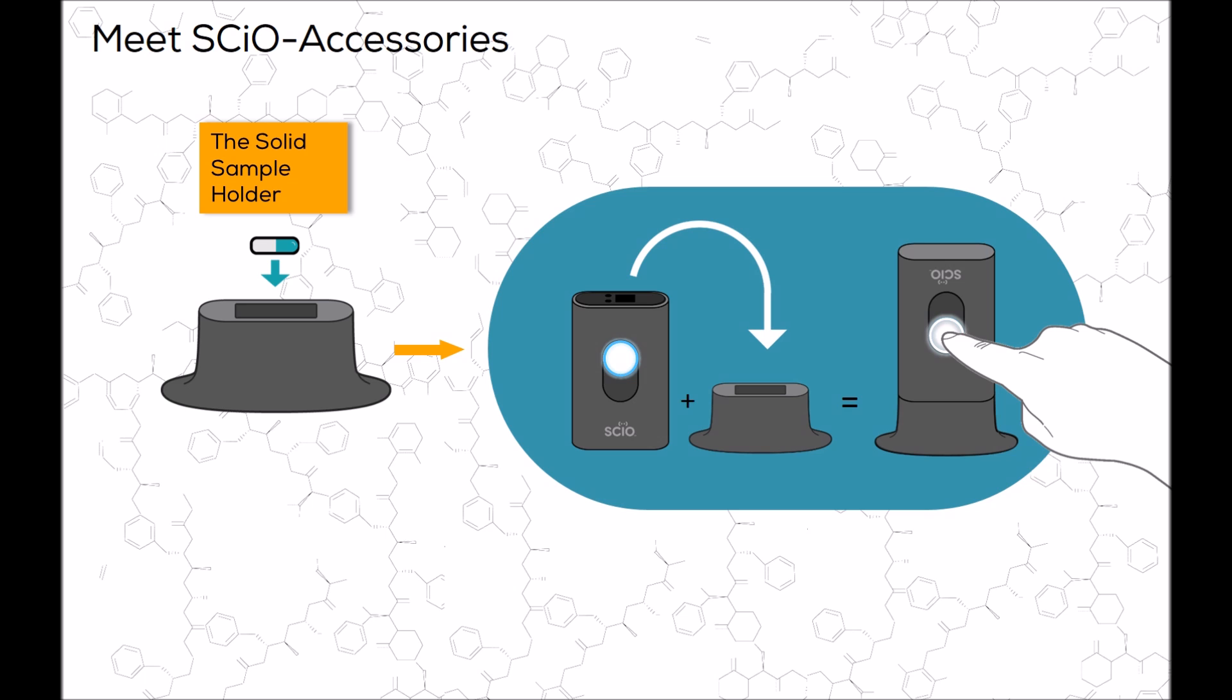The sample holder has a shiny gold coating lining the inside. Damage to those sides or the bottom of the inside will affect your scans. Make sure to keep the holder safe from dust and dirt when not in use.